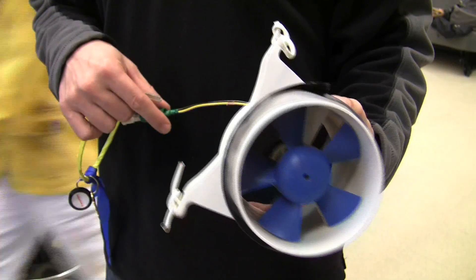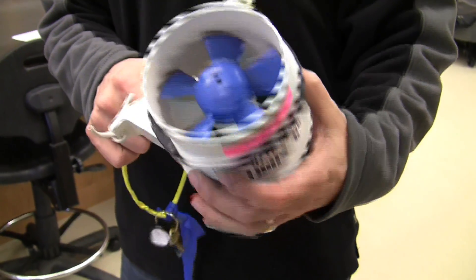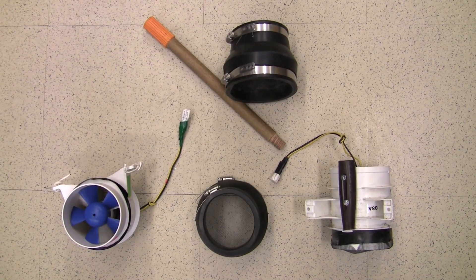We found motors developed for boats — actually for ventilation of fumes from gas tanks — that would fit our needs in terms of weight, cost, and size. The next step was going to a hardware store and trying to get the other parts that would make up our aspirator.